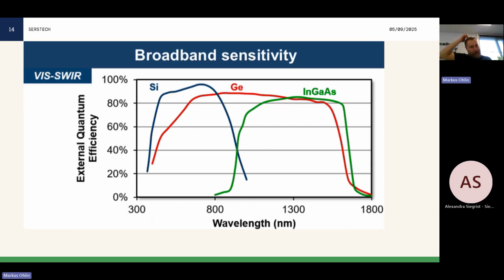Here's another representation where you can clearly see the span and wavelength ranges for when you choose different detectors. So, yeah, it's clear to see that you have to switch from a silicon-based to an InGaAs-based sensor when you move up to the 1064 nanometer laser.